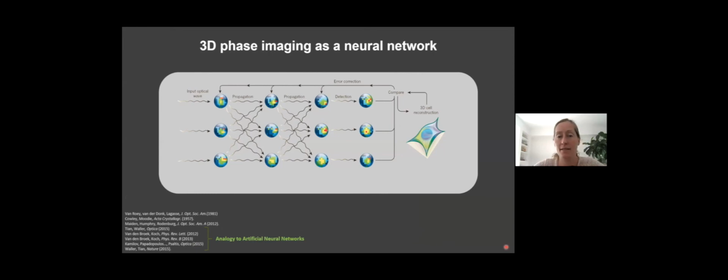A lot of this stuff has been done long before us. But it's really exciting because this is like a neural network, nonlinear, non-convex optimization. We can't prove it will always converge. We can only heuristically look at when it works.